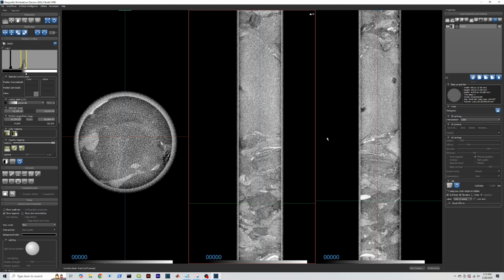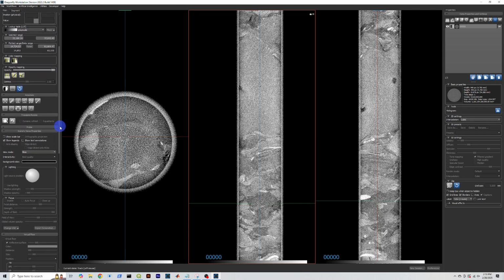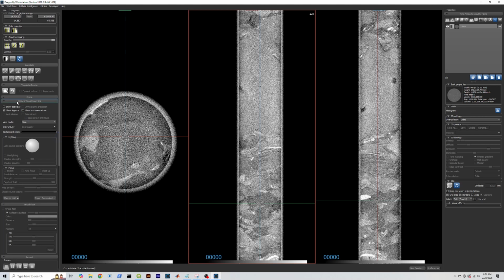The next thing that we're going to do is remove a little bit of the speckle noise that we see in this image. And we do that by changing from a sliced view, which is a single plane, to a statistic of a slab average. And so we can do that here by going to Scene Views, choose the window that we want to create a slab average for, and then instead of choosing slice, we go slab average.